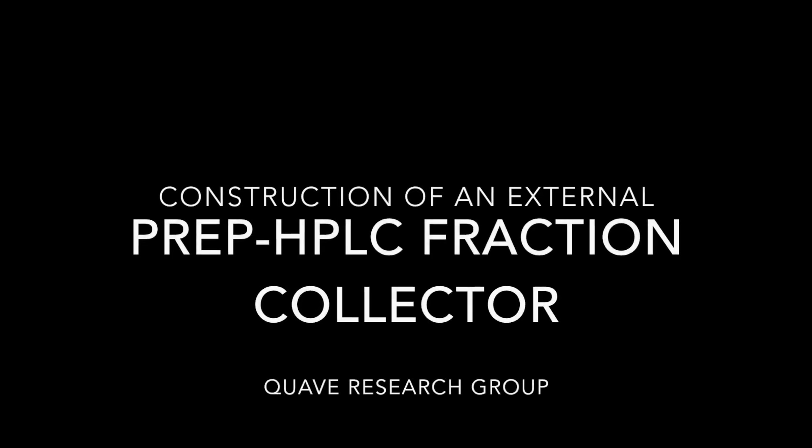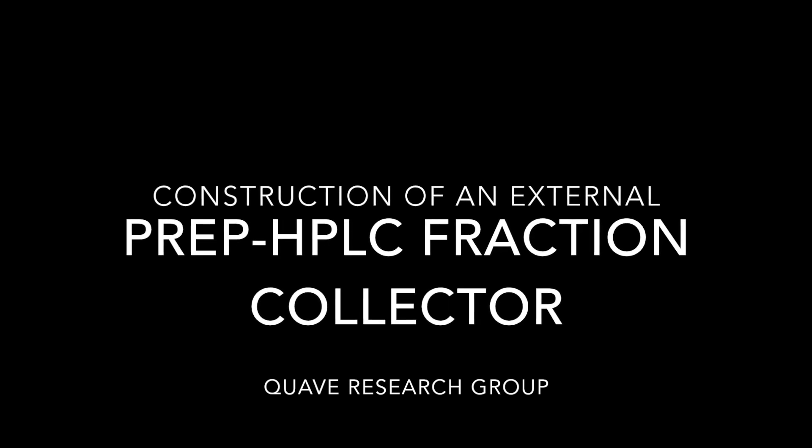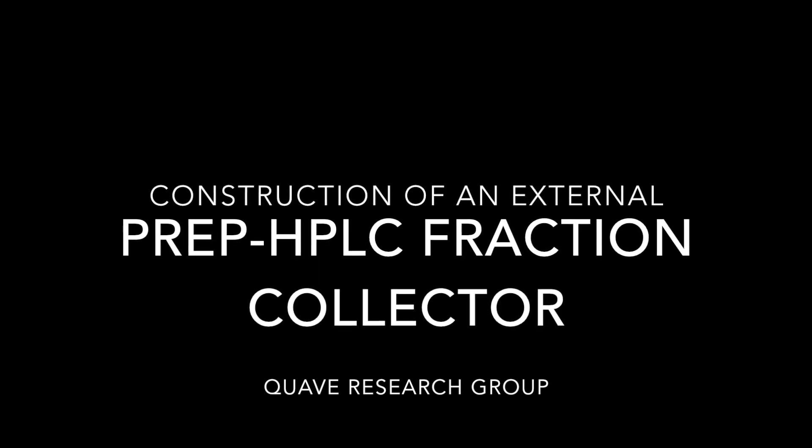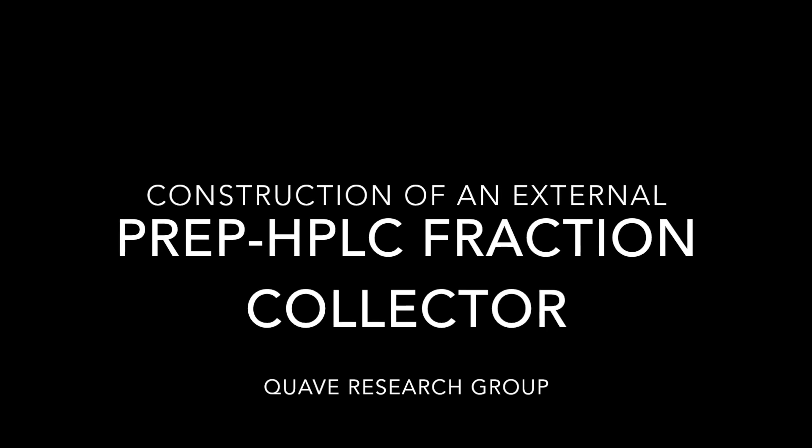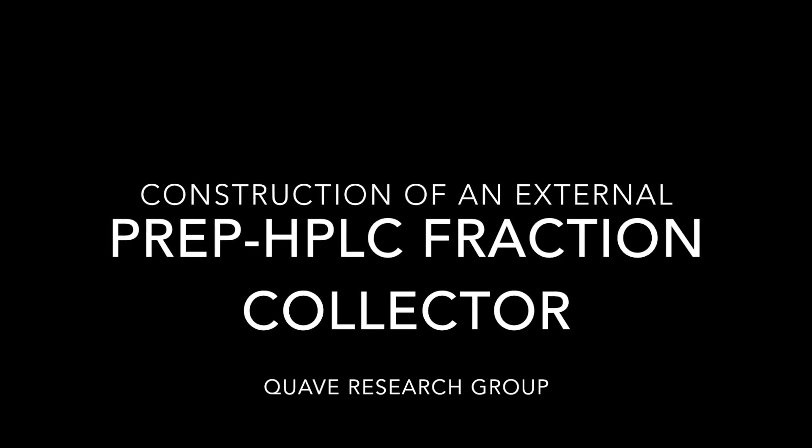Hi, this is Dr. Cassandra Quave, and in this video, we're going to describe how to construct an external preparative HPLC fraction collector out of simple materials, including Legos, Lego Mindstorm, wood, and metal.